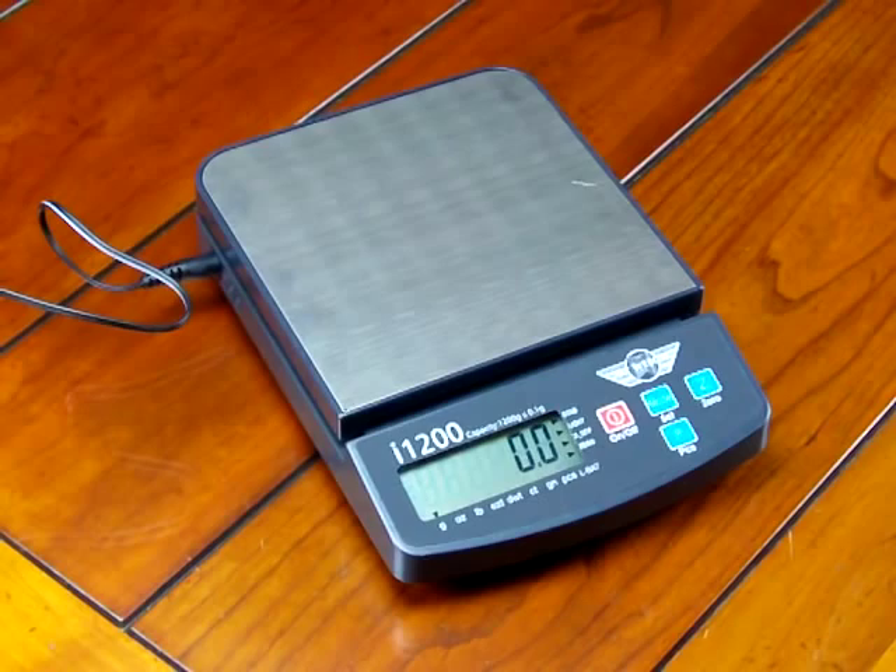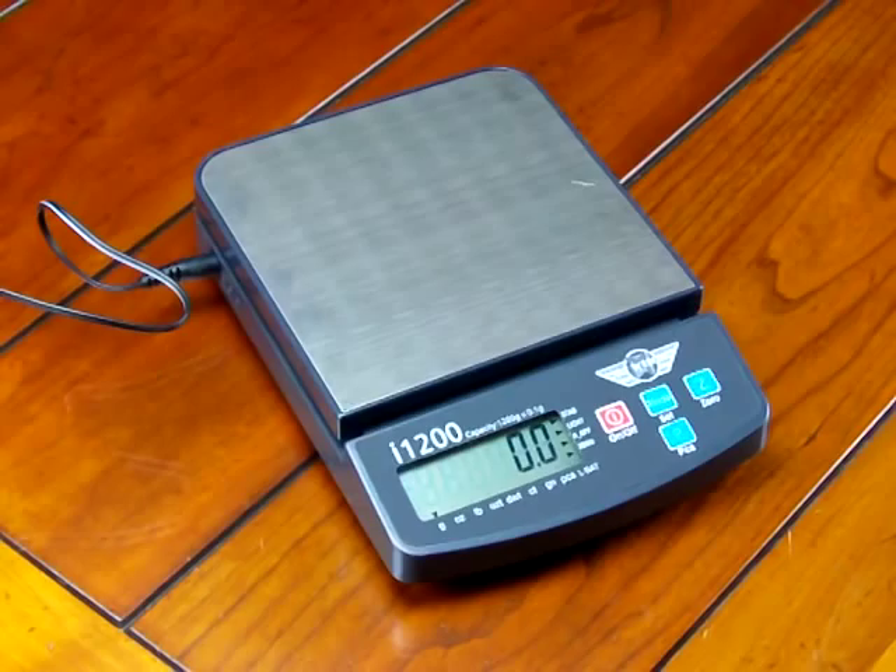The majority of people that purchase these scales don't buy the calibration weights, but we highly recommend that you buy them. It's an optional accessory. On any scale in this price range, the calibration weight would be an option.